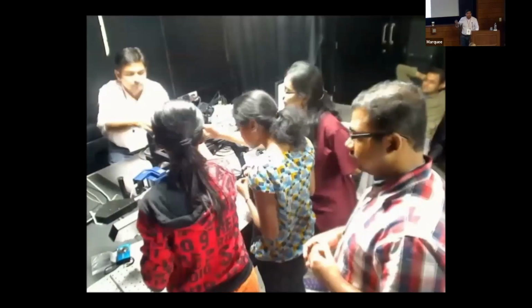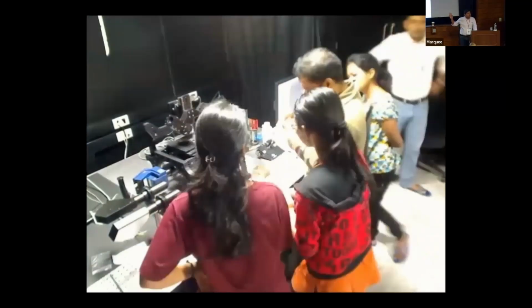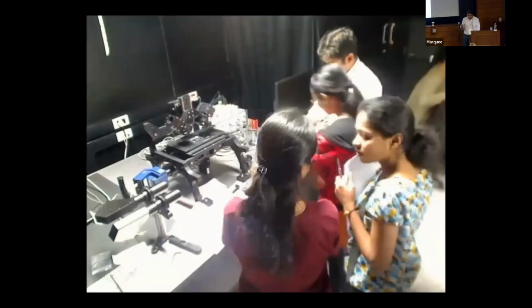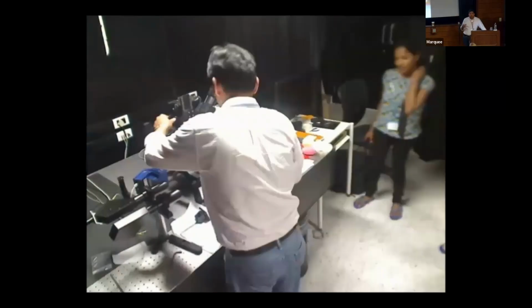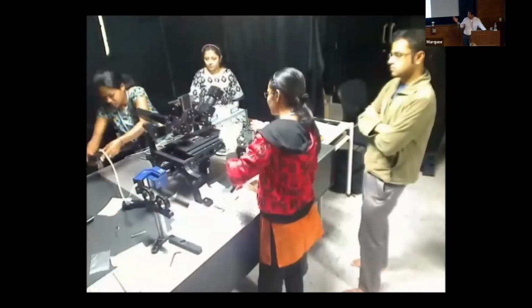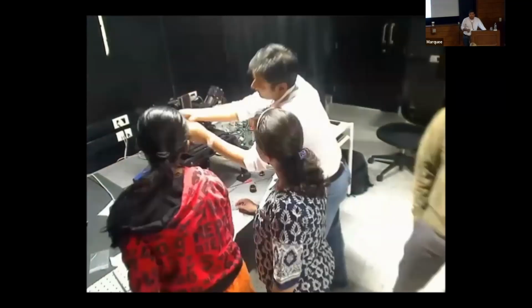This is one example. Hari Shroff, I was a postdoc with him. He's now at Janelia. Some of you know him well. He and I were invited to teach at the Bangalore microscopy course. And as a part of this course, we had to offer a project for 2 days. And we decided to offer the project of how to build a light sheet microscope. At that time, if you remember, there were not many commercial systems. There were a few open source systems where people could build this.